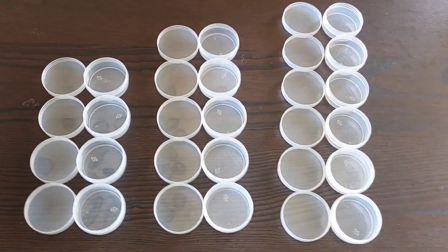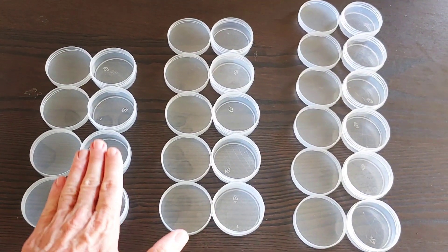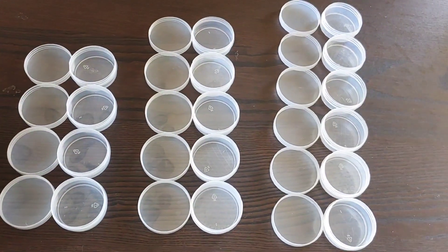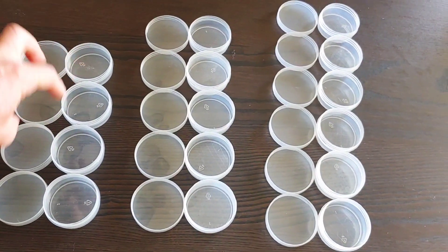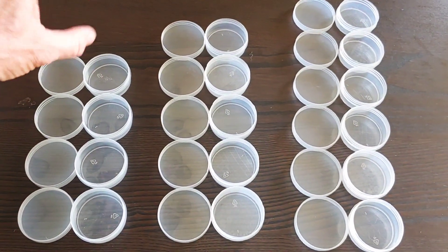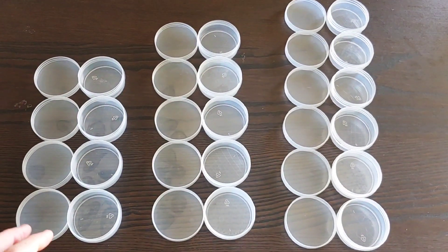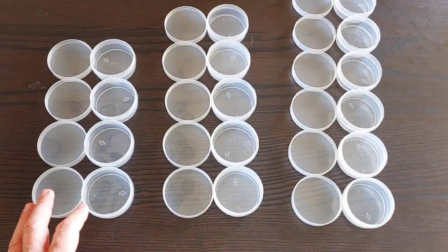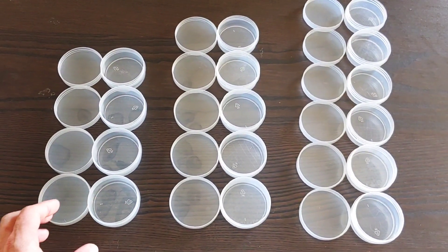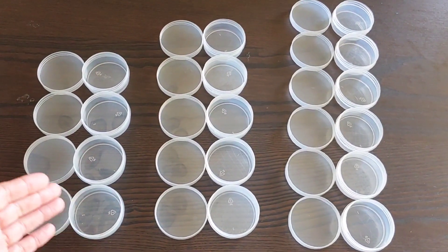We're going to experiment to see how many cups I can stack for the condensation fix to work, putting the hot water on top. I'm going to do them all with hot water because that should give us an idea of if it works or not. I'm not going to do agar because I don't have to make any agar cups right now.